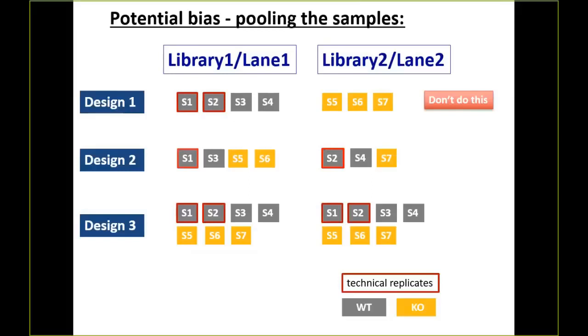Even if I just give a core 1 lane worth of samples, they'll still multiplex it out across all 8 lanes. This kind of covers their rear end. Imagine if I have 1 lane that just fails. Instead of losing all the data for all the samples on that lane, I've lost 1/8 of the data for all the samples in general. So some of those samples are still going to be salvageable, and there might still be some usable information.